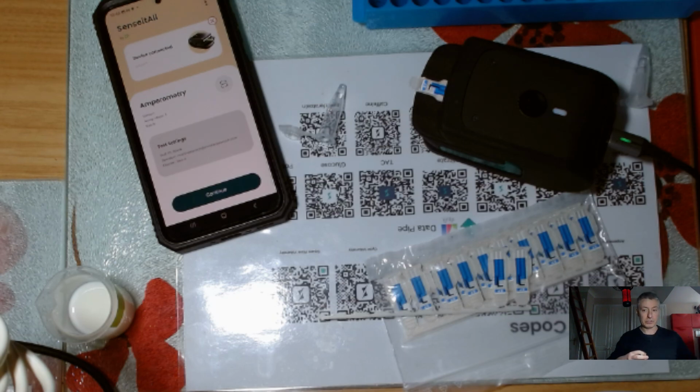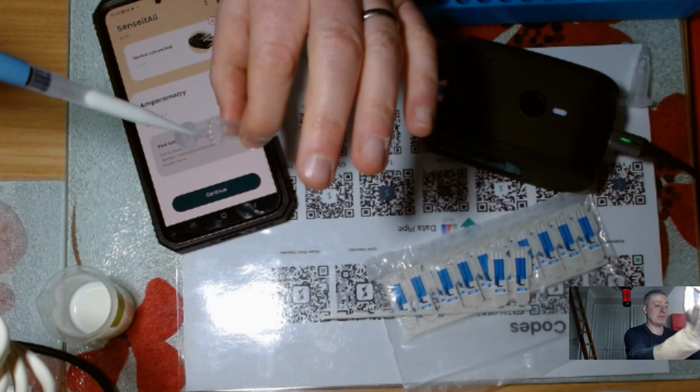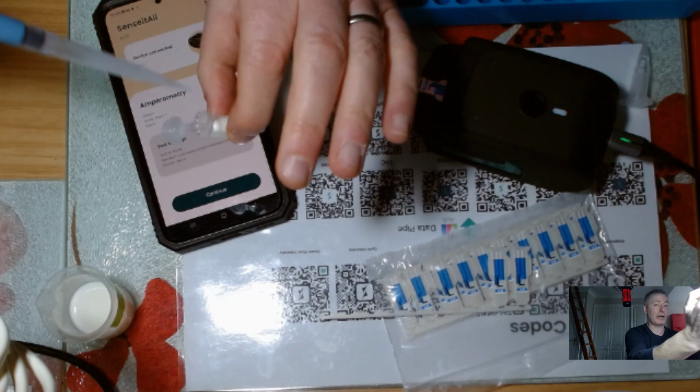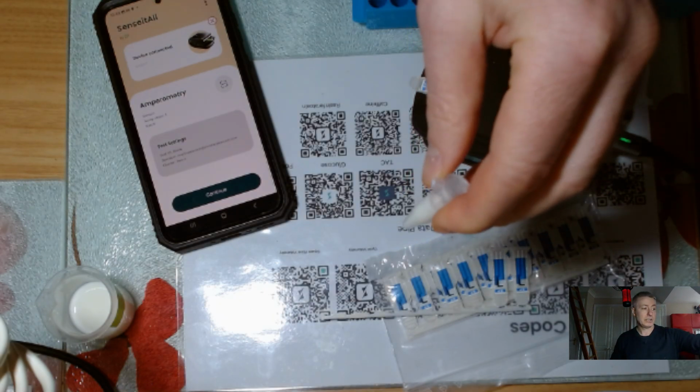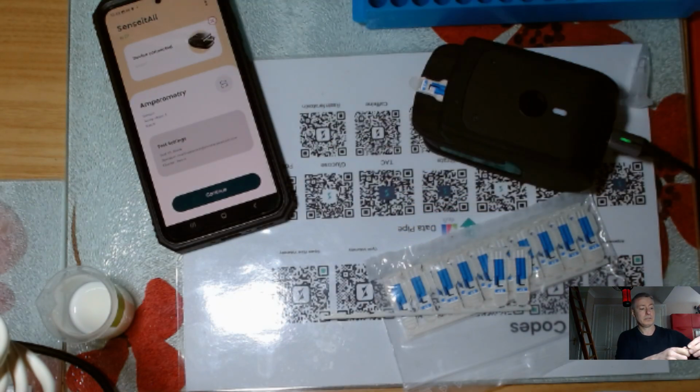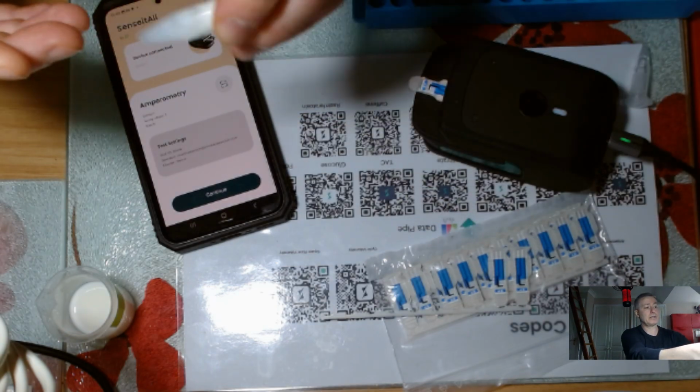What I'm going to do is an approximate 1 in 10 dilution with that. I'm just going to grab some milk. It's a complex sample. It's fairly representative of the complexity of the real world. I even think that PAA, peracetic acid, is probably used in washing down equipment that's been in contact with milk. So I've got that mixture together here.